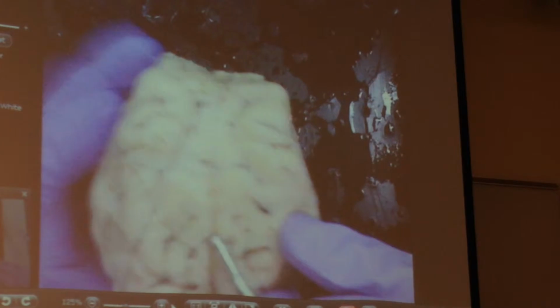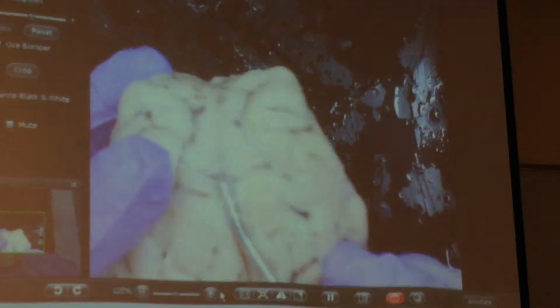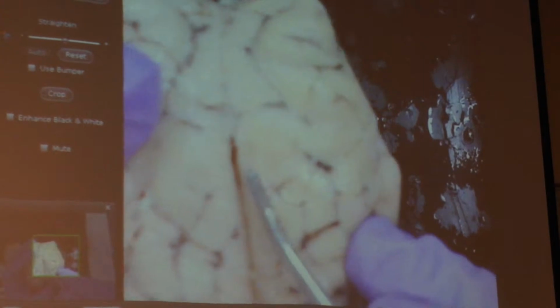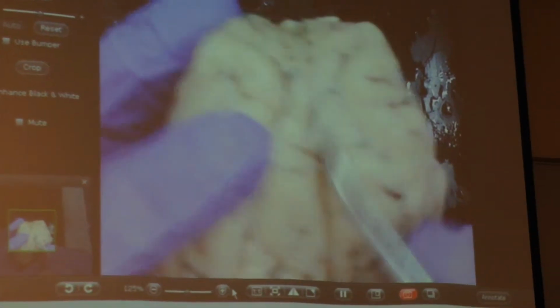So here again, if I go down this fissure right here, I see this membrane right here. See how I'm picking it up right there? See, now I'm going to pop through it right there. That was arachnoid mater that I was just popping through right there. All of that right there.